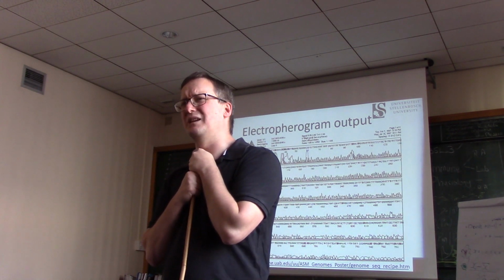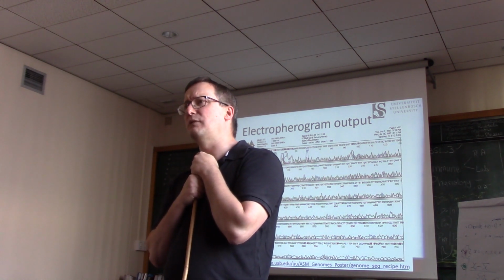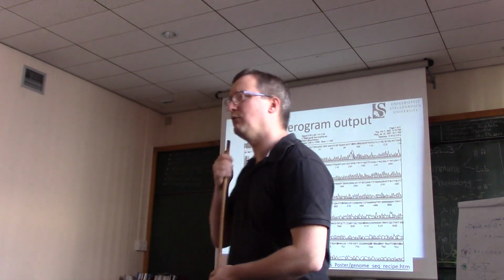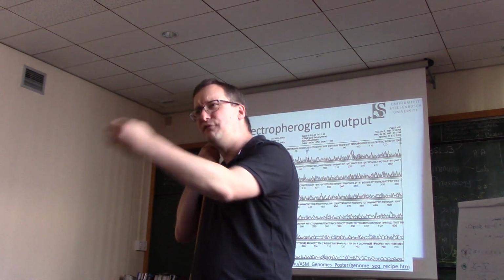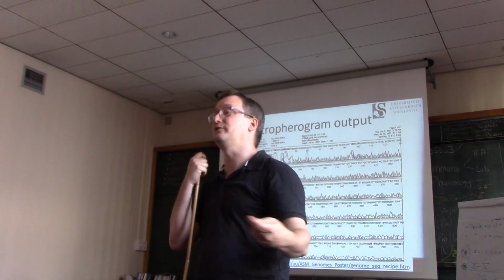Okay, which brings us to electropherograms. Now this concept might seem a little weird if you have never seen one before. This represents an old school sequencer, like a Sanger sequencer. And I want to explain how the information collected by this instrument relates to the base calls that you see in the reads.